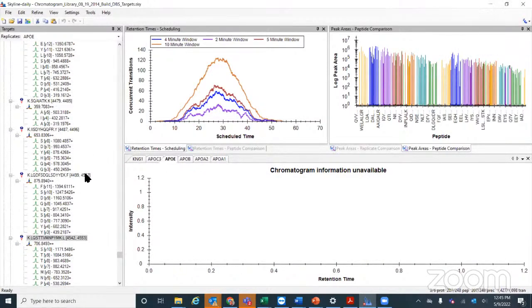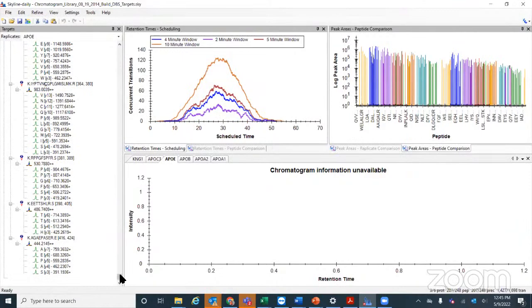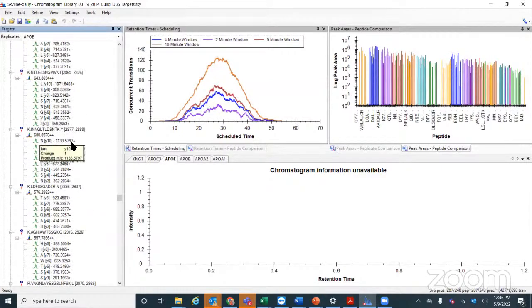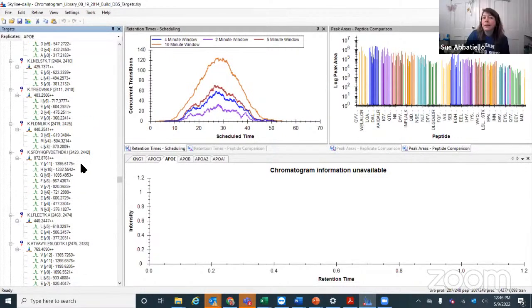Okay. My knee-jerk reaction when I see one that's very far above the others would be to exclude that particular ion, even though it's very high intensity. Is that something that you would suggest, or is there a particular benefit to having that ion?